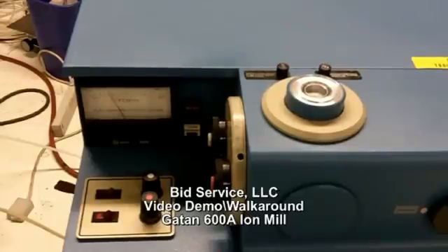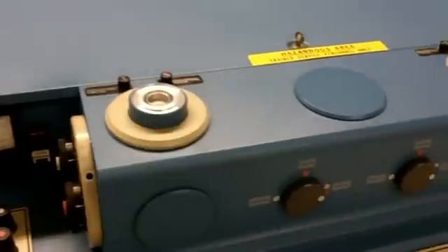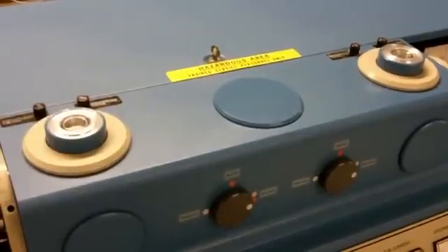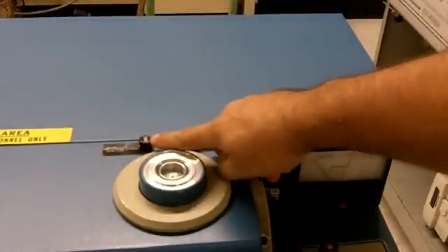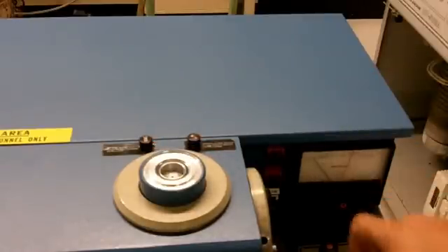Once the system has pumped down entirely — right now it is in the 6-ring — we can begin to pump down our sample chamber, which are the small round blue discs on the top, and begin processing them with the ion mill. To pump down the chamber, we need to press intermittently on the vacuum button, making sure that our pressure does not rise above the orange indicator.